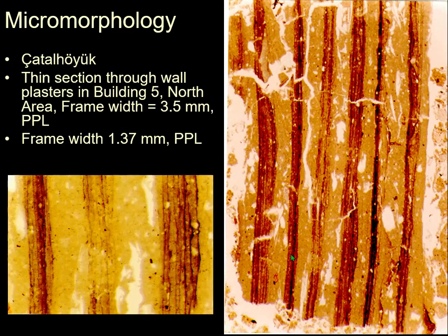And also they thin section the wall plasters. And it was very interesting to see that the walls were repeatedly replastered and repainted. And you can see layer after layer of major plastering and then minor touch-ups of the plaster walls, which was a very interesting finding, I thought.